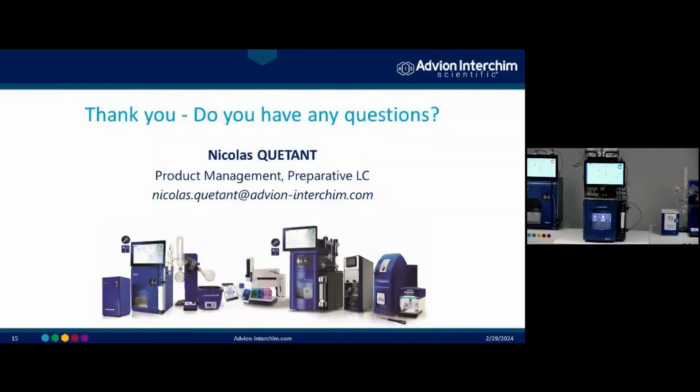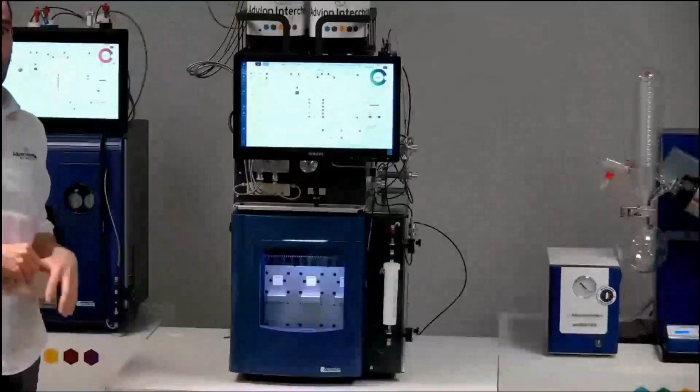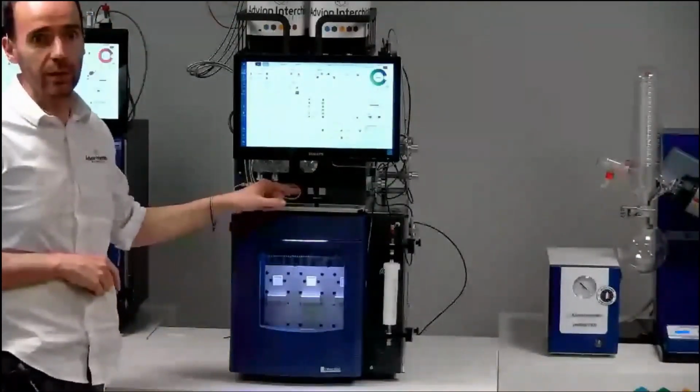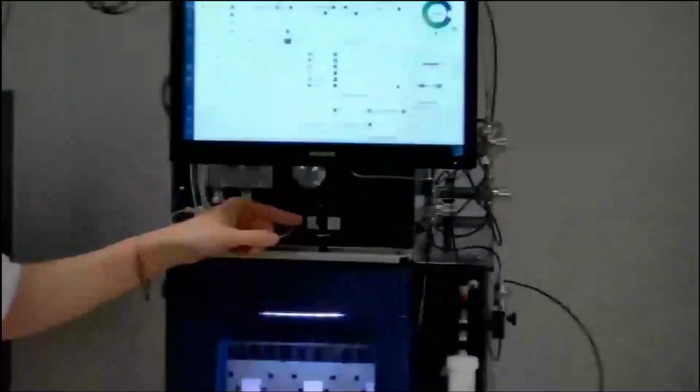Let's move on to our next question. It says, regarding safety, is the system equipped with leak sensors or other safety options? Yes, of course, we have many safety features on this system. First, we have leak sensors that you can see just here.